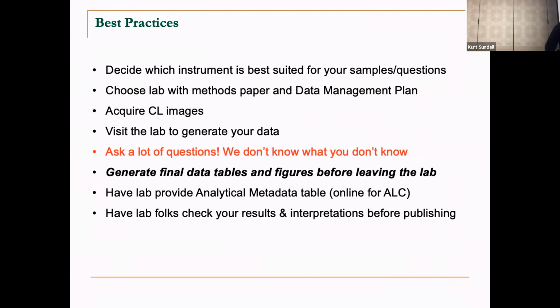Yeah, finding standards is hard. It takes a lot of time. It takes a lot of just mounting things up, zapping a bunch of things, seeing what's reproducible and what's not. I know that the calcite world is really struggling with this. I can put you in touch with some people. I don't know if that would be useful, but I know several people that are working on that actively and also struggling with it. Any other questions?